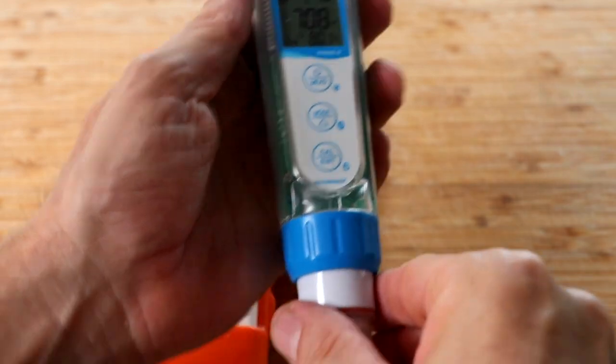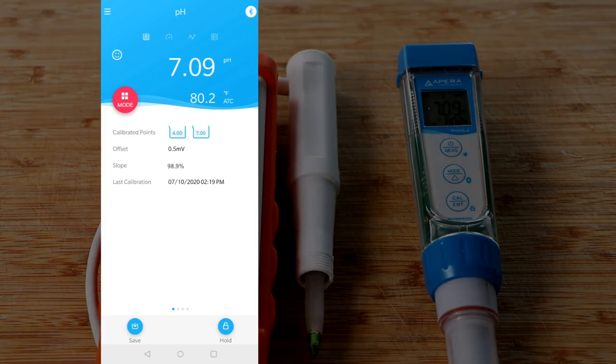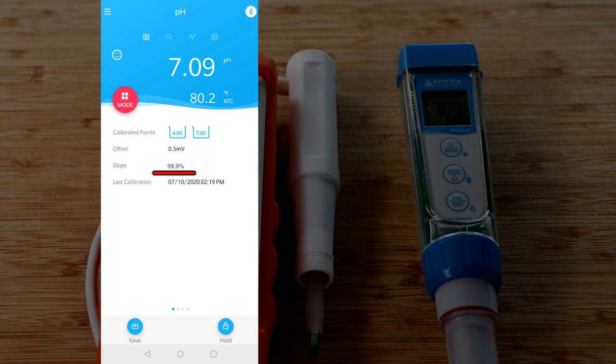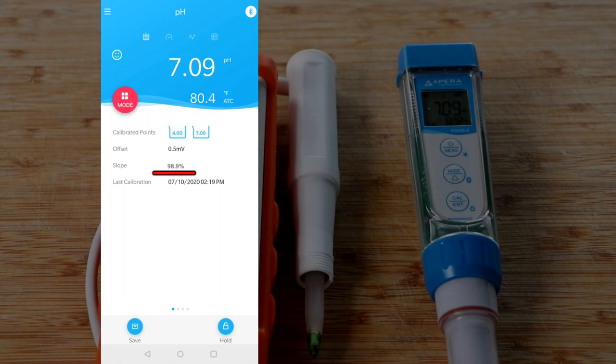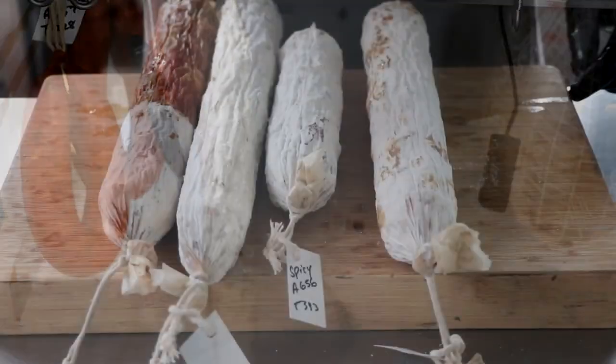Let's take a look at the Apera Instruments pH meter — this particular feature comes on the PH60S-Z. If you take a look at the app on the home screen you're going to notice some information. Right in the center it's going to tell you when was the last time you calibrated your unit, which is absolutely brilliant. But right above that you're going to get an actual slope reading, which means this particular pH meter calculates your slope for you every time you calibrate. The range for slope is anywhere between 105% and 85%, and as soon as that slope percentage drops below 85% you're going to want to consider replacing the probe. This kind of information is priceless especially if you're making things like salami or cheese where pH is critical.